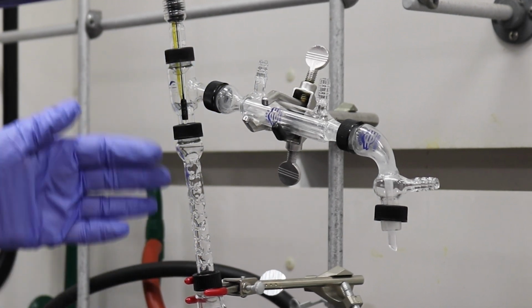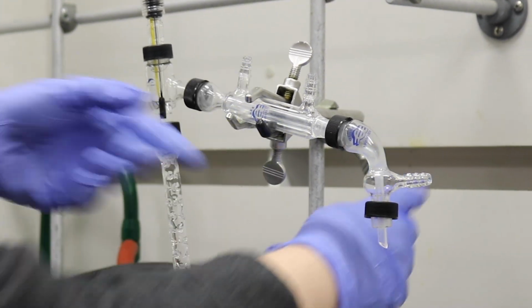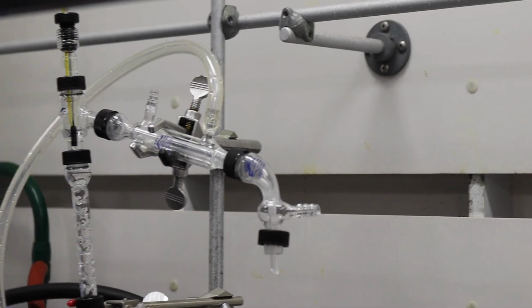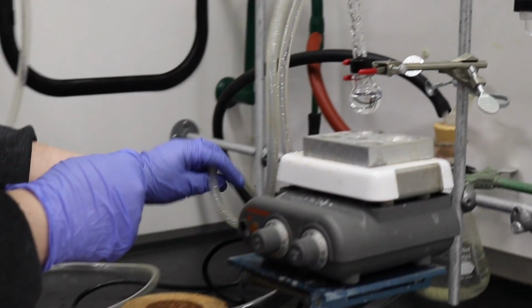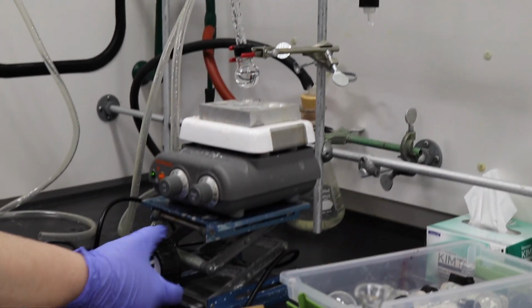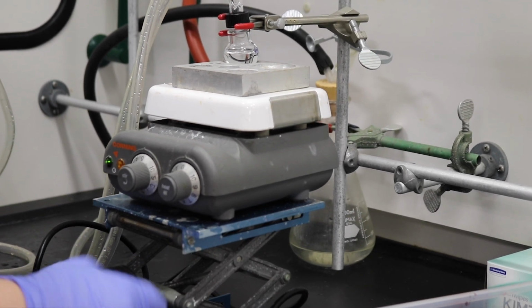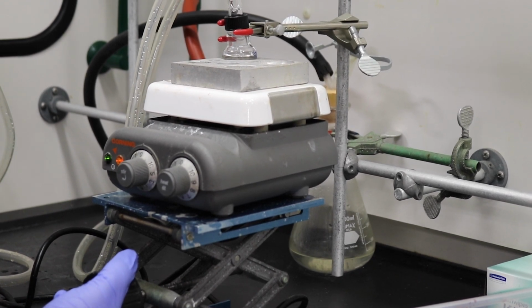and now we have to make sure that our system, just like the simple distillation, is straight. So we have to adjust our clamps in any way. Then we take our thin wall tubing, water goes in the bottom and out the top, as you see here, and water going out to the cup sink and in from the water inlet. And we have to plug in our hot plate, raise the hot plate to our round bottom flask. Just all the same steps as we did with simple distillation.